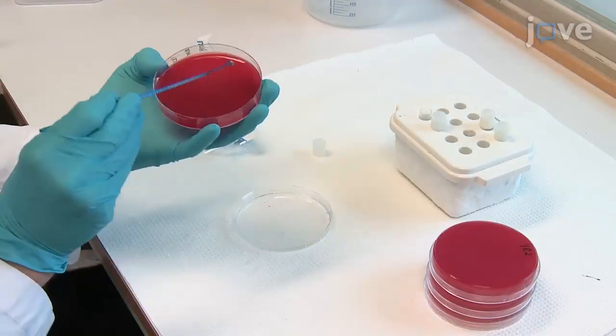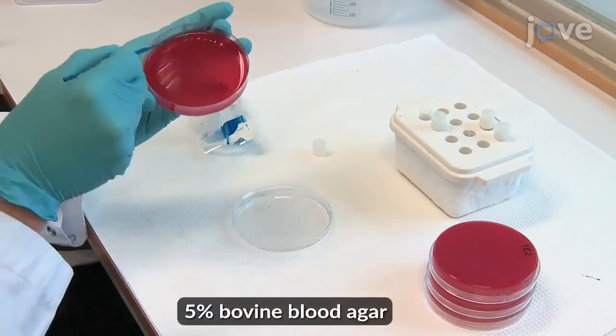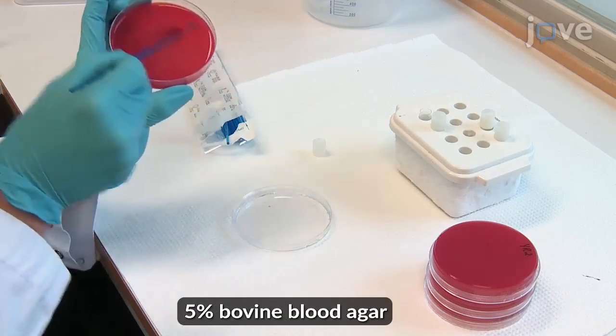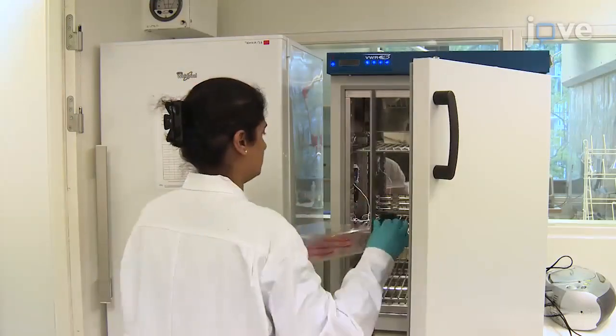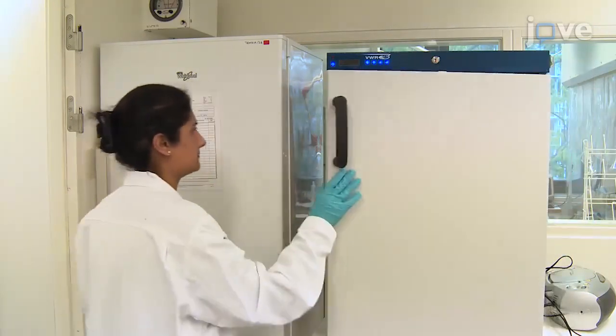To begin, use sterile inoculation loops to streak out Yersinia ruckeri pure cultures on any suitable agar type on petri dishes. Incubate at 22 degrees Celsius for 1 to 2 days, or at 15 degrees Celsius for 3 to 4 days.